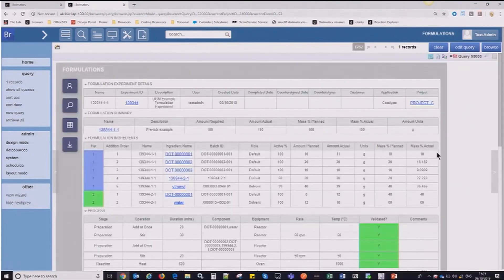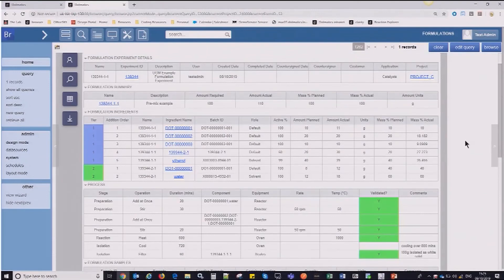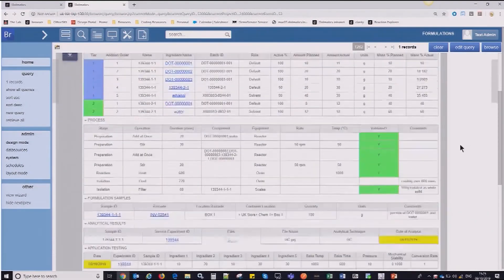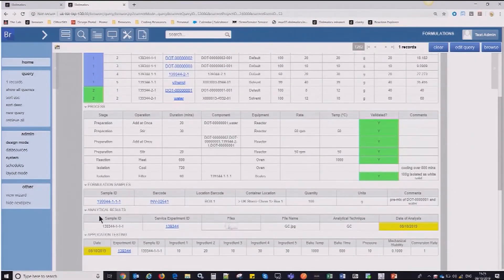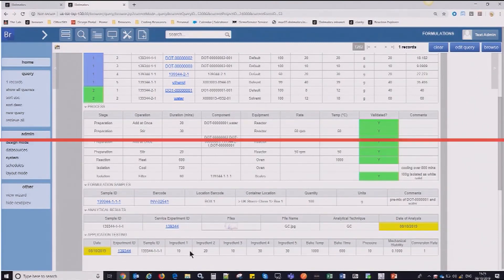If I jump back just to the formulation-centric view and move on, we've also got the information for the analytical results and the application testing data all in one place.